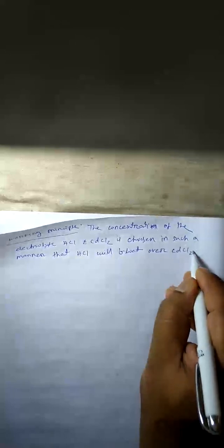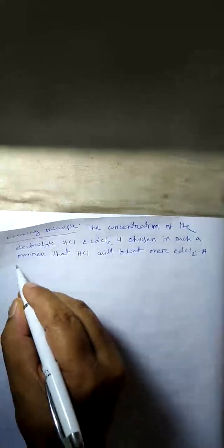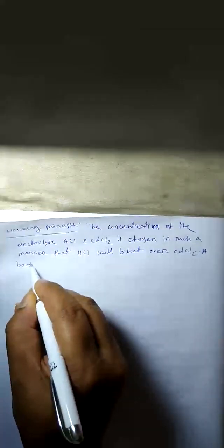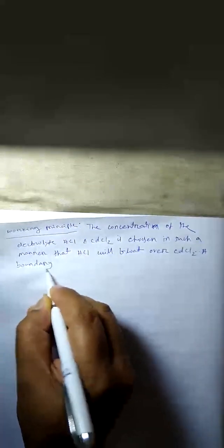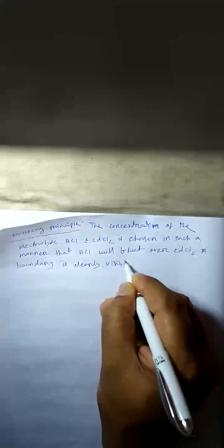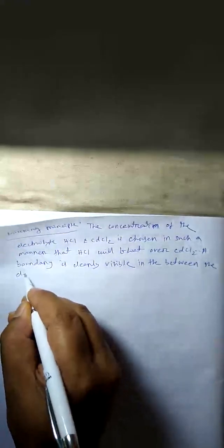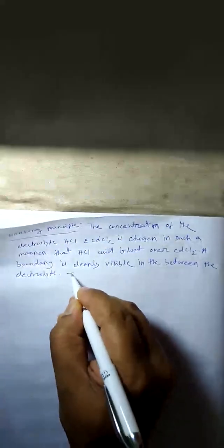So a boundary is clearly visible in between the electrolytes.